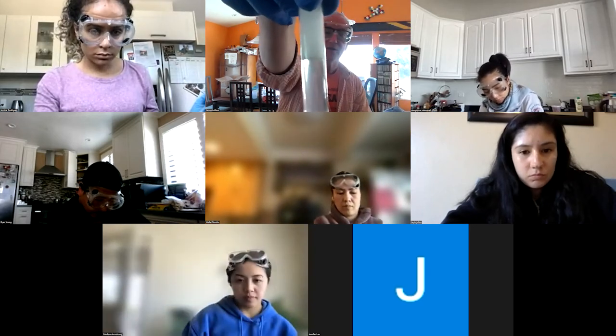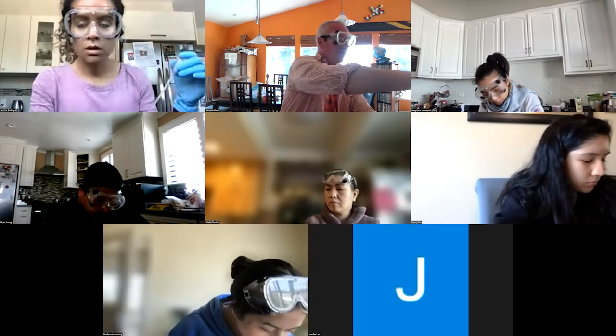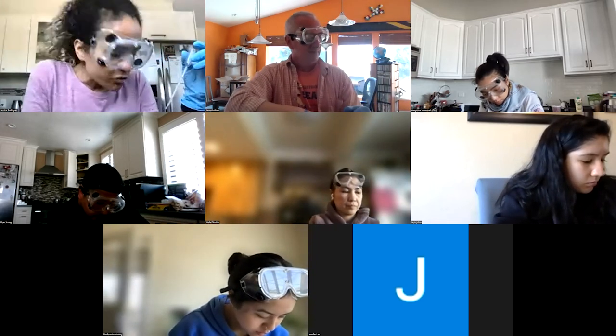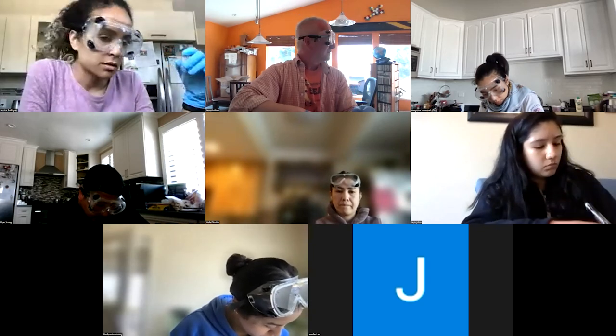Even if I saw slightly fewer bubbles with the hard water, with the oil it was the big difference, because all of the oil went into the micelles. With the hard water, even with three drops, I could see the oil separated. I still have it separated. So we should add the 3 drops to the hard water too? Yes. Okay.